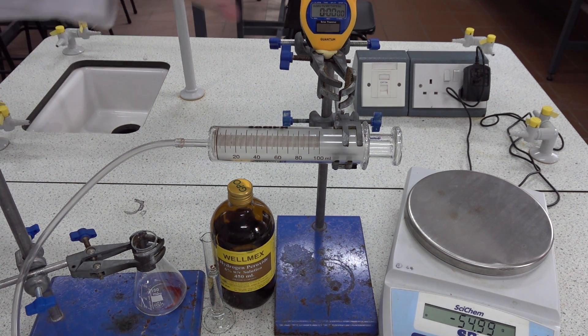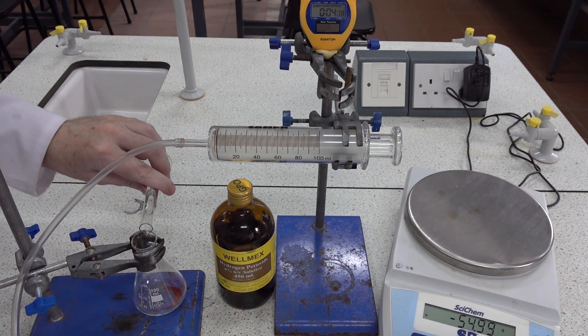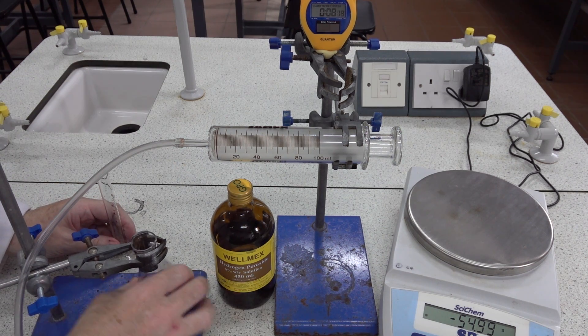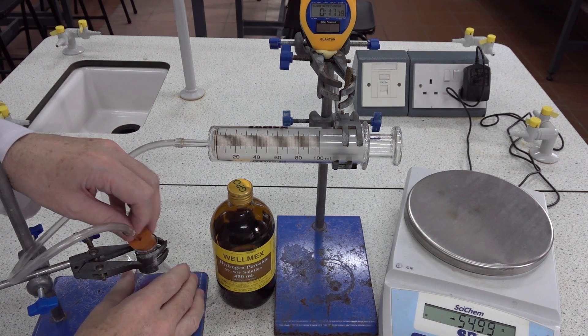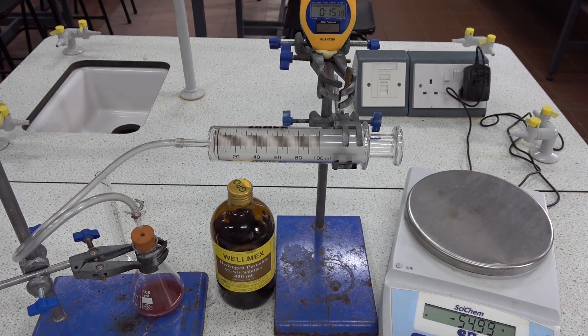We've got 10 centimeters cubed of 6% hydrogen peroxide in the measuring cylinder. Start the stop clock, add the hydrogen peroxide, give the flask a little shake, insert the bung, and measure any evolution of gas with time.